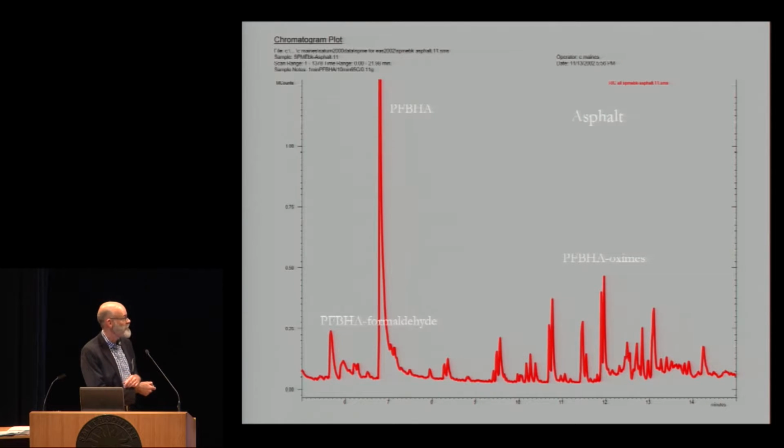And then here's a sample of asphalt. I don't actually have a photograph of it, but this was something that NMAH called me in desperation about because they had done multiple Oddy tests on this material and it had not failed, and they really thought that it should fail. Because how can you have asphalt in a, anyway, it just didn't seem right.